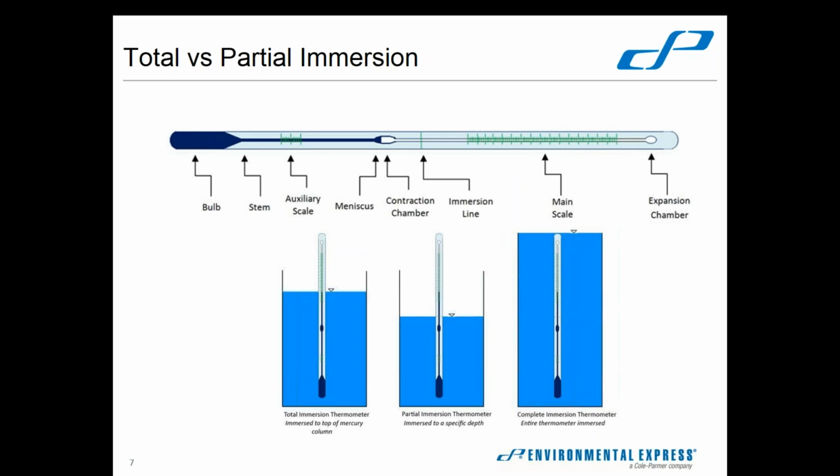Your regular liquid in glass thermometers, there's a couple of types, and this was something that I learned also during an audit response, I think, at one time, when one of the findings was that the temperatures were not being taken correctly, and that the temperature compensation was not adequately addressed. So one thing that they found was that we had a partial immersion thermometer in use in an incubator.